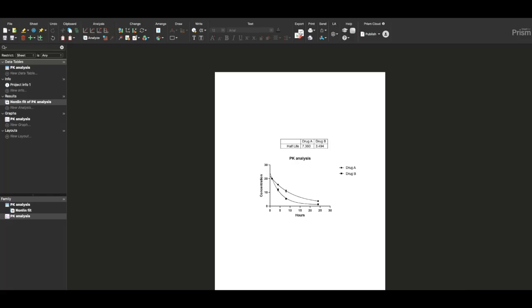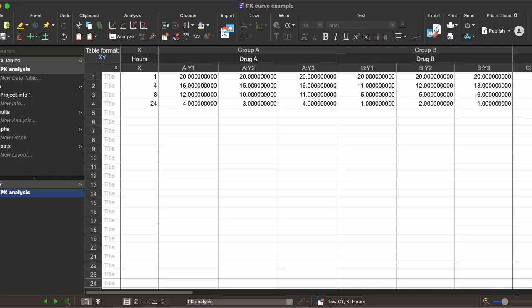Hi everyone! In this video I'm going to show you how to make a pharmacokinetic or PK curve using GraphPad Prism version 10.2 on a MacBook. So these steps could look a little bit different on your screen. Here I'm showing sample data for two different drugs with different pharmacokinetic properties.